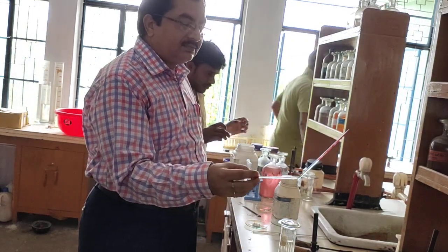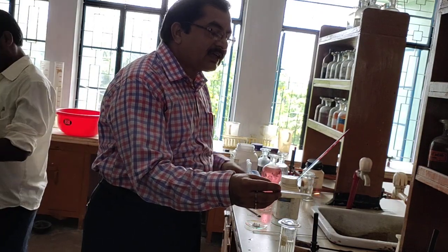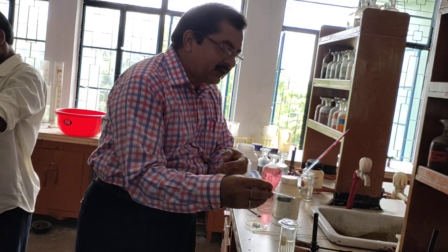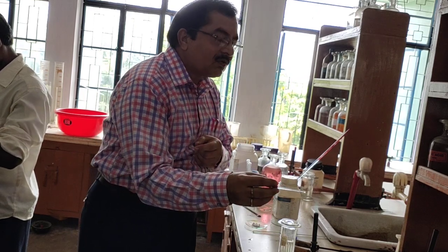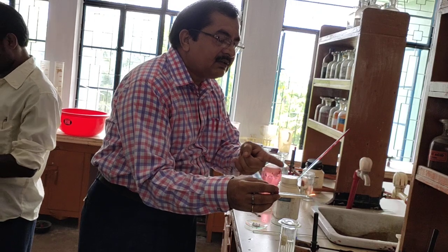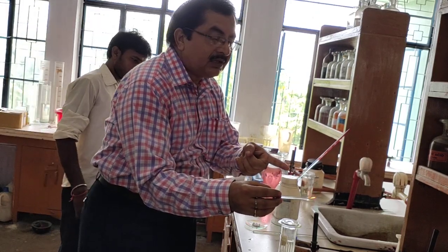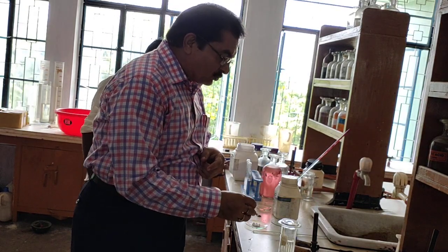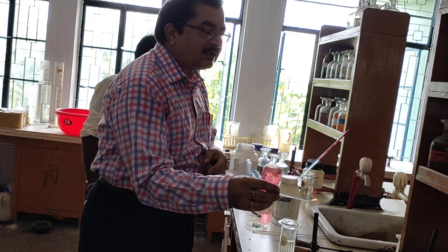Now another salt, see, its color you will see, its color is on the tip, you see the color, its color looking like a brick red. Once more, see here clearly. Here you see clearly brick red is there. Now see the color of the flame, and when we are putting this one, you see the color of the flame. Clearly, it is looking like a brick red. Brick red. So brick red color shows that salt of calcium maybe. All right.